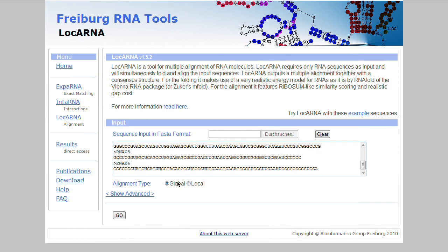You can see they are now all in here. Now I just choose whether I want a global or a local alignment. Local alignment would mean I expect the sequences are different — maybe completely different — but have certain parts that are similar, identifying only those identical parts. Global, which is what we do now, means to compare the entire sequences.